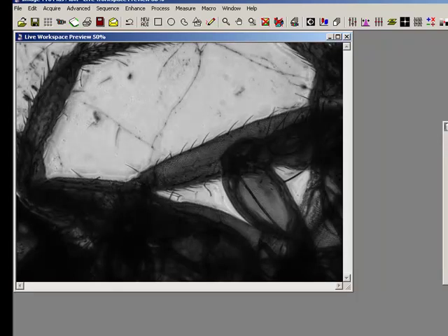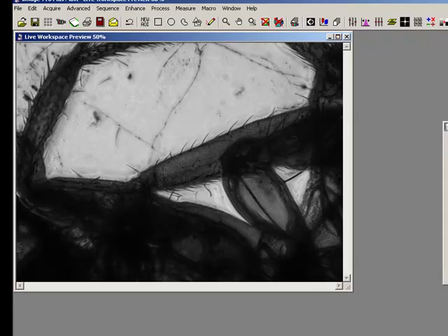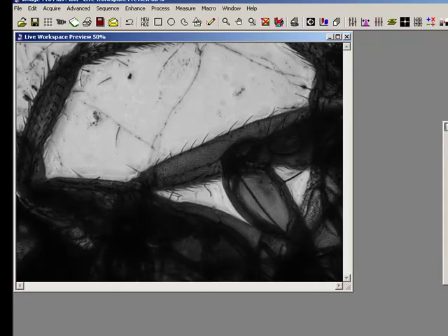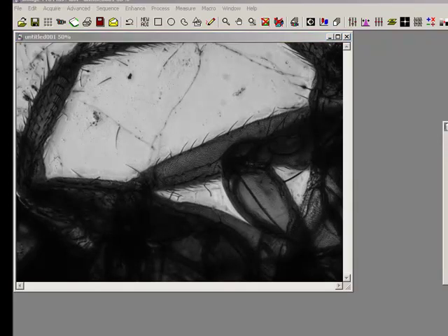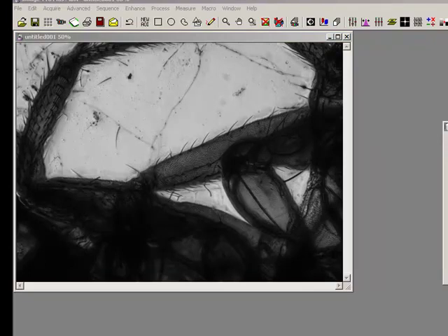I can even come back up through focus and try and add in more information. You can see that's pretty neat. And when I'm ready, I can just say Capture and that's the file that I'm going to keep. Really nice, really straightforward.